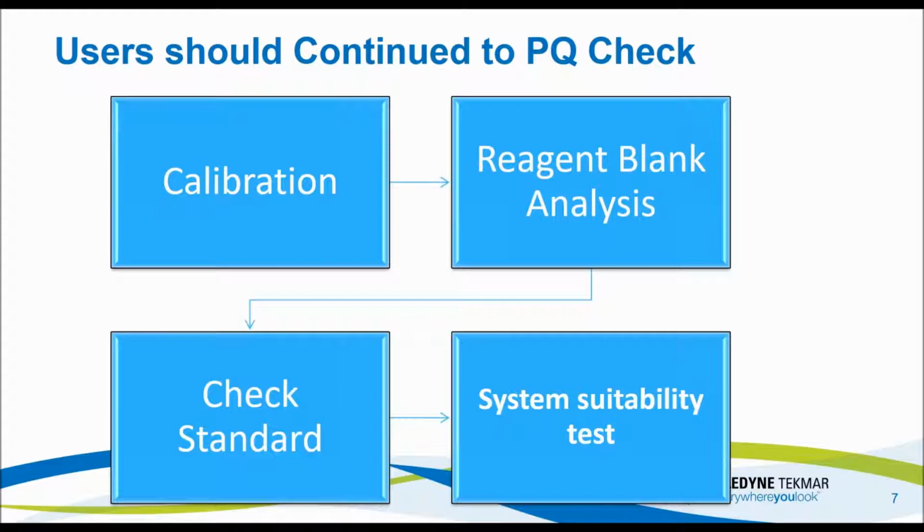And then I do like to do a system suitability test about, I would say, every 6 months to a year. Run a USP 643, just make sure that it's oxidizing those compounds at the same rate. And I'll, of course, talk about that more later.